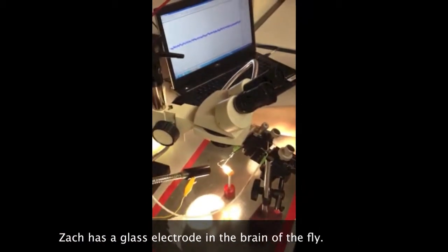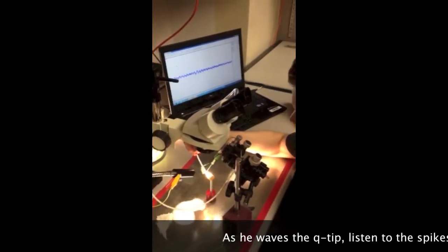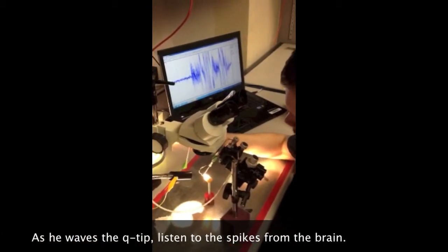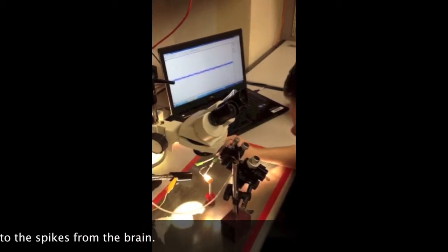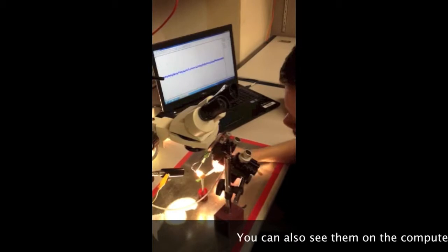Yeah, that was a good one. Wow. Zach? Try not to rotate it. Try just to go in a line.